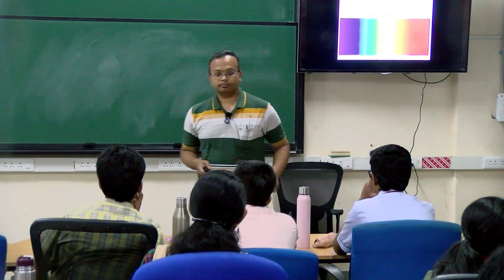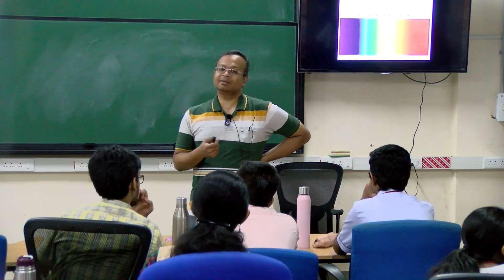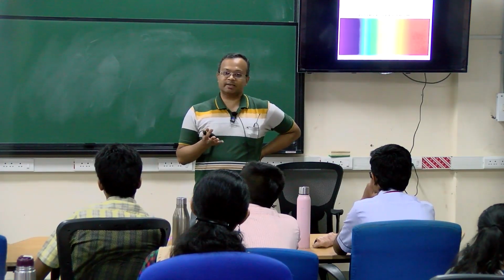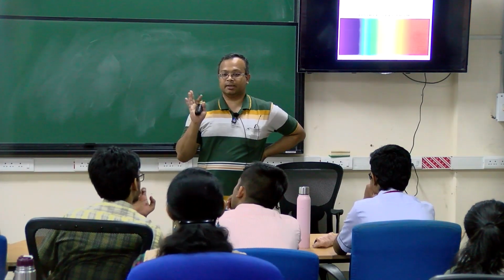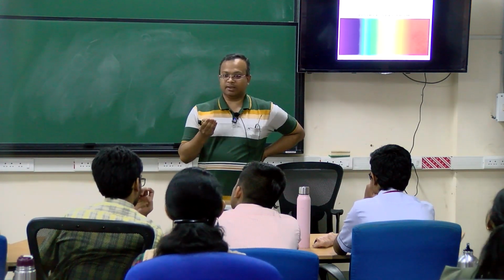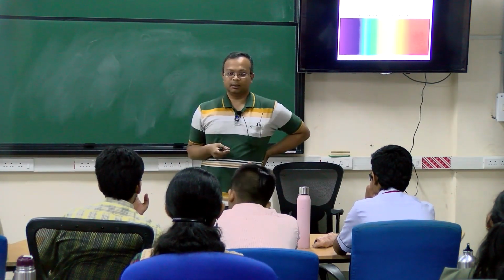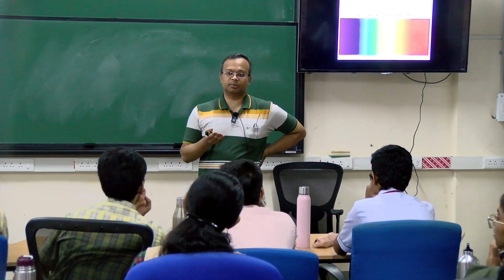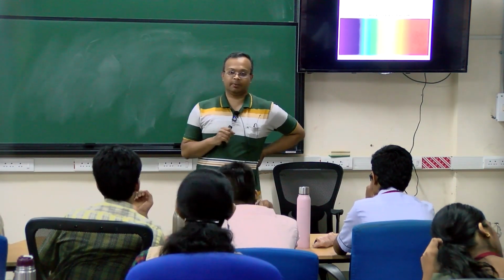So yes, that stain has to be, yeah, if that stain can stain them separately, you can, but most stains don't differentiate between them. So one example that I showed you earlier was that red color stain. It will stain the nucleus in slightly dark purple and the background in light purple. That is the only difference you will see. But with most of the stains that we see under a light microscope, it's not possible to distinguish between the organelles of the cell. Okay. So for that we need to label it with fluorescence.